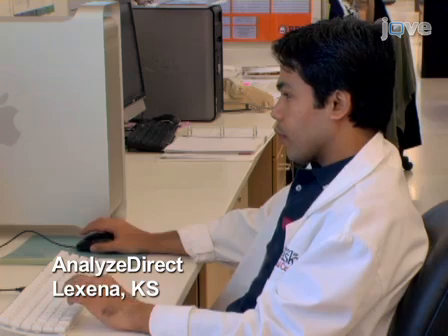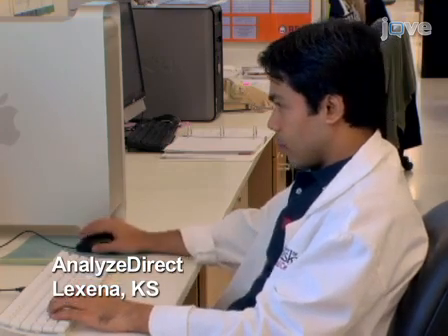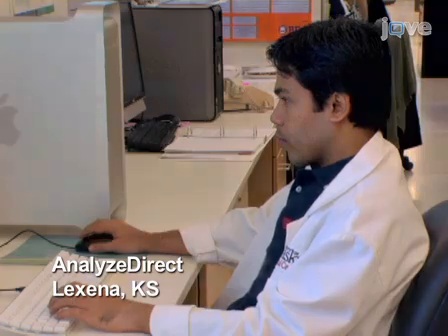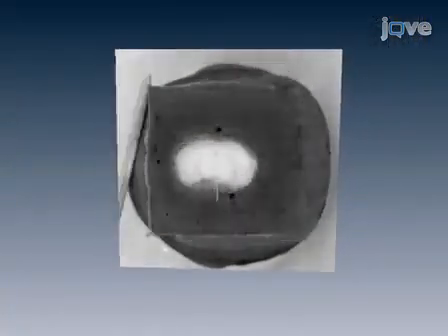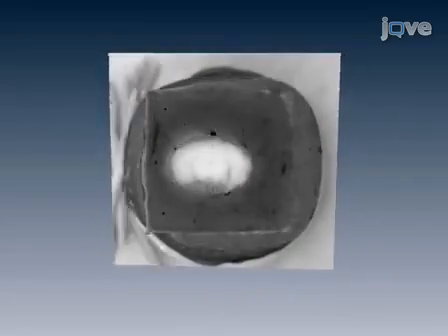Align individual block face slices to reconstruct the 3D volume, using the block outlines to account for jitter in the position of the cryostat head. Then, automatically segment the brain volume using a seed-based region growing algorithm in the Analyze software package.